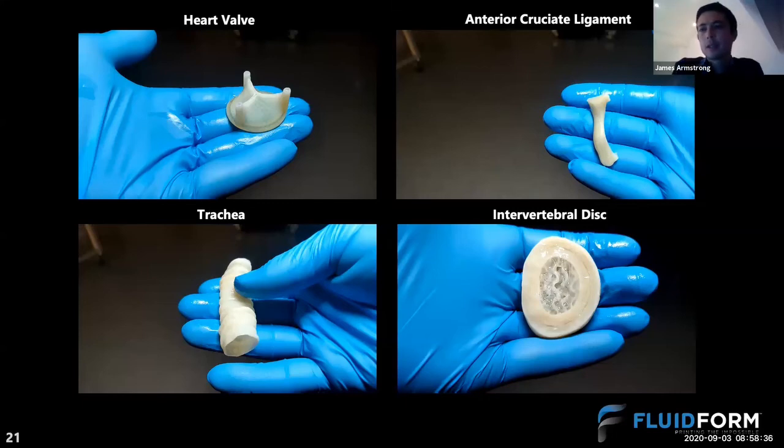Yeah, I was just wondering about the support material and whether there did need to be a degree of tuning for different materials or different concentrations of materials. So would you be able to use the same support material for a very, very soft collagen solution and a very, very stiff collagen solution?